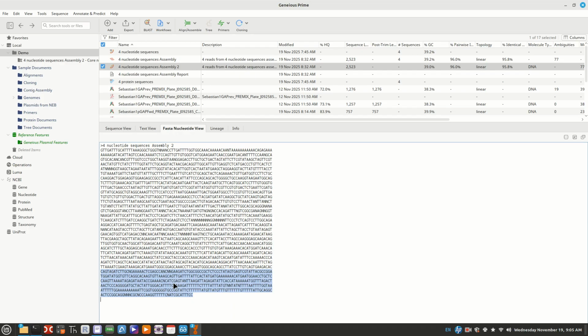because this is identical to a particular vector that's used somewhere. And the BLAST results, it's kind of like Google. You search for something, and this is overwhelming our results. And so this region, what I found, doesn't let us get any good information if we let Geneious do the analysis all by itself. It's because this piece really needed to be trimmed out, and I obviously didn't get that out of the lab. I didn't get this piece out. So let me show you what it does show us.